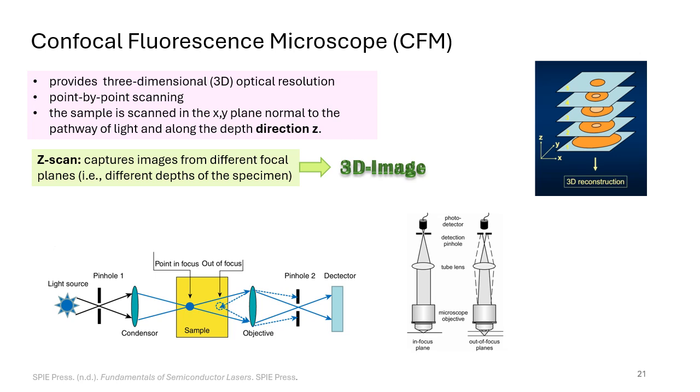So, confocal fluorescence microscopy is a technique that provides 3D optical resolution. In microscopy, 3D resolution is generally realized by designing the instrument so that it is primarily sensitive to a specimen's response coming from an in-focus plane, or by subsequently removing the contributions from out of focus planes.